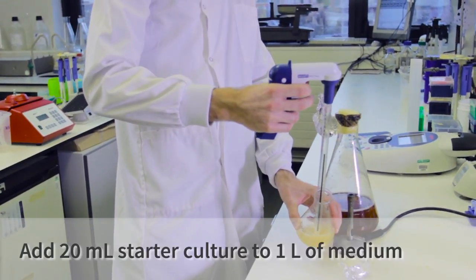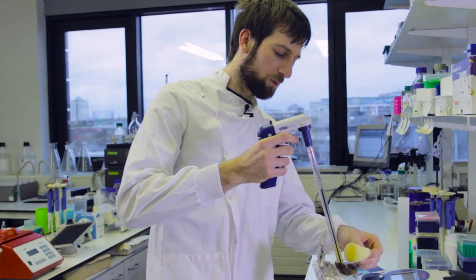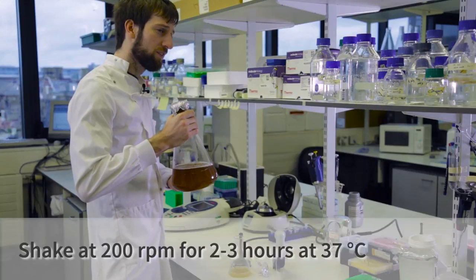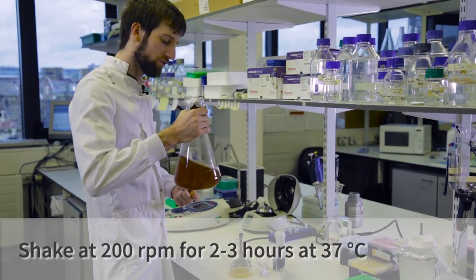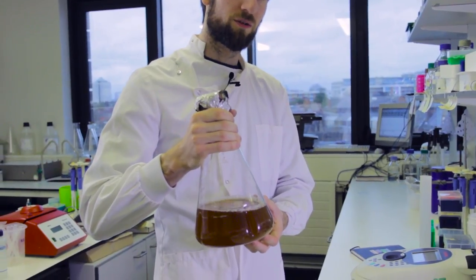I'm going to use 20 mls of starter culture to inoculate one liter. This means we'll get to a good optical density of cells when we're ready to express our protein. Now we take our cells and put them at 37 degrees at 200 rpm shaking to make sure we get enough oxygen into the media to grow the cells to a high cell density.